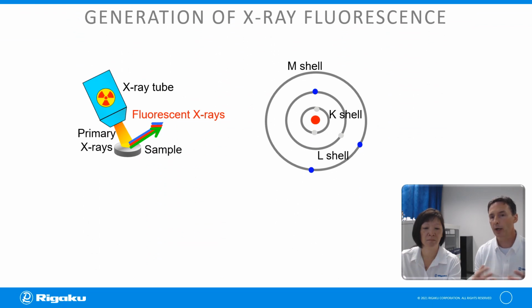So just a quick one minute of information on how XRF works. How is it able to analyze for these elements or metals in my sample? I will give a one minute overview, but if you can come to our session at 2:30 Central Time, you can see a little bit more. We have a 90-minute session. We're going to talk about some of the theory. We're going to actually do prepping calibrations and running real samples, right?